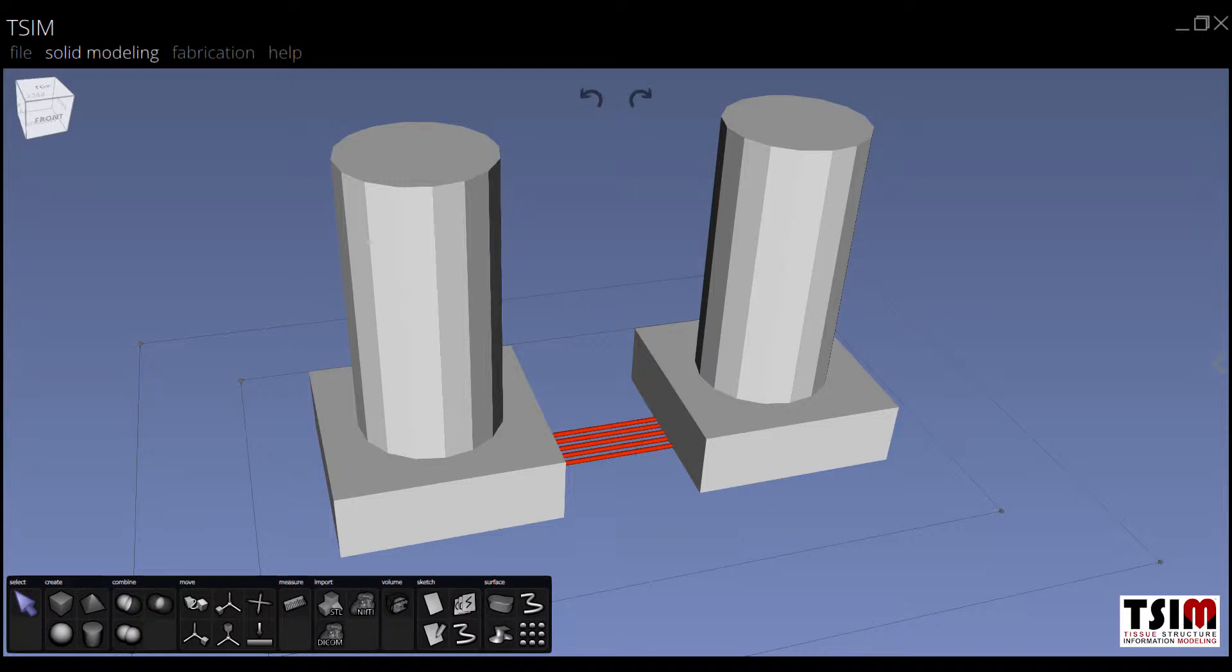And connecting the two reservoirs are five parallel microfluidic channels, shown here in red, which will serve as the perfusion routes.